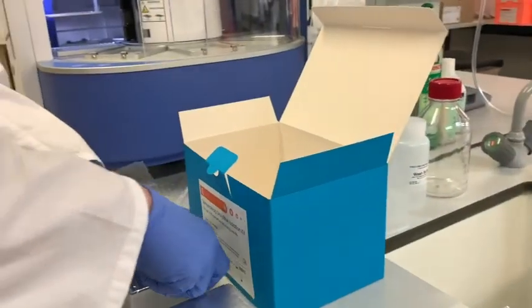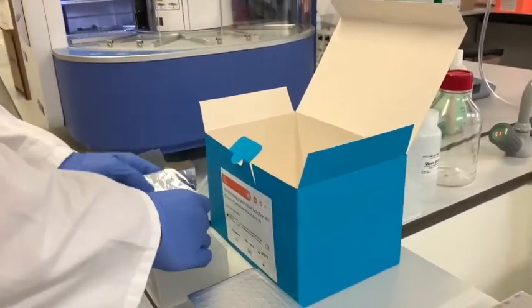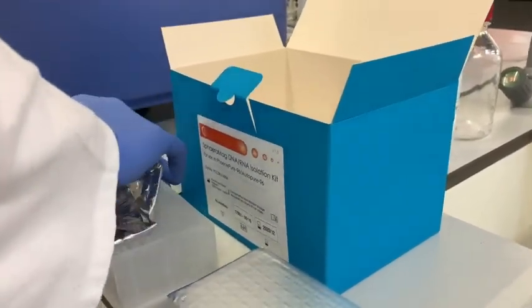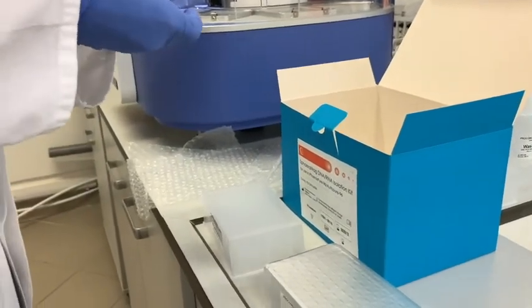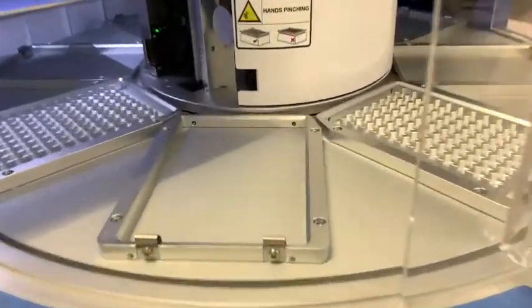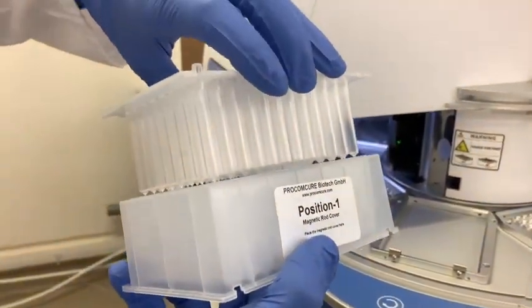Please make sure when you receive the box that all the wells are included. Before the extraction, slowly remove the aluminum cover from the wells. When placing the wells, make sure the number positioning is the same as the extraction machine.